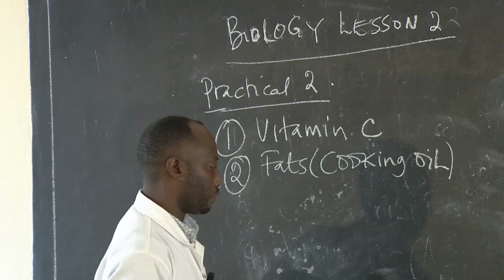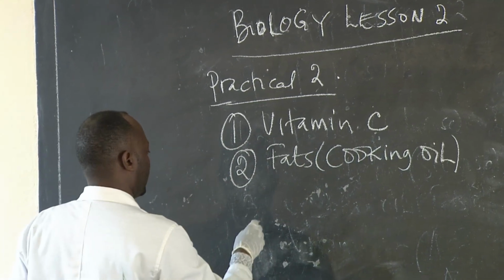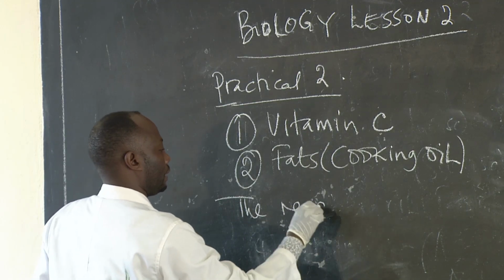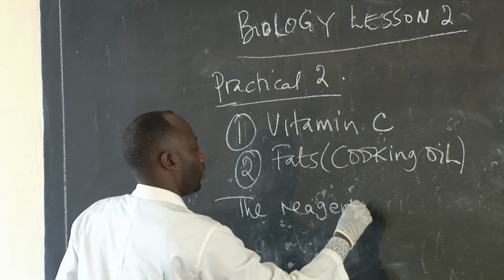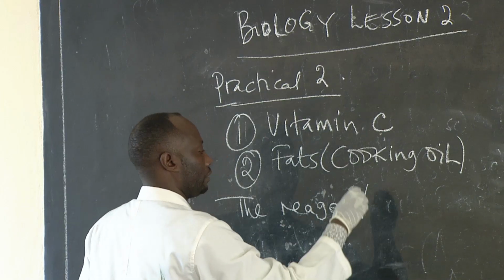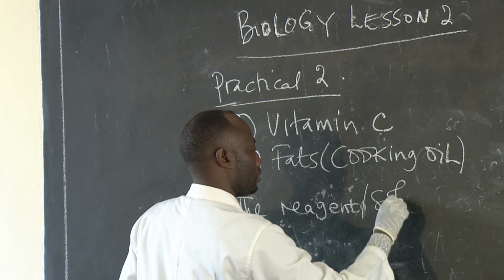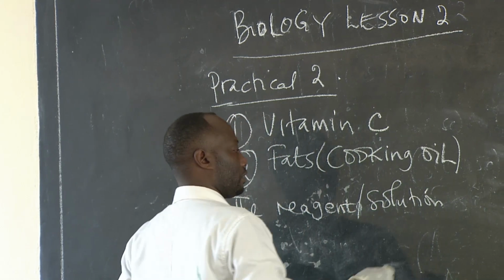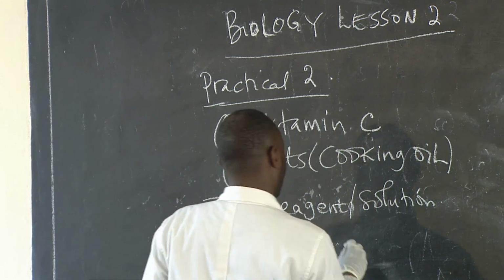Students, you also have to know that these are the reagents you are going to use. The reagents or solutions that are needed for testing these food substances.